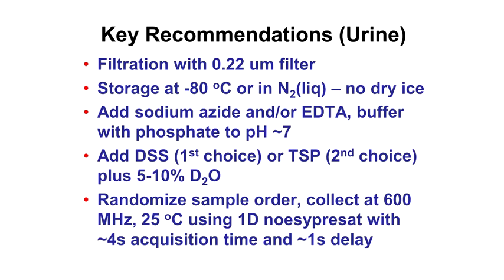Frankly, TSP is a very poor choice as a chemical shift referencing reagent. It's highly pH dependent. It induces faulty carbon chemical shifts, and it's also sensitive to other problems with the matrix. You have to add a lock solvent. 5% D2O to 10% D2O is typically used.